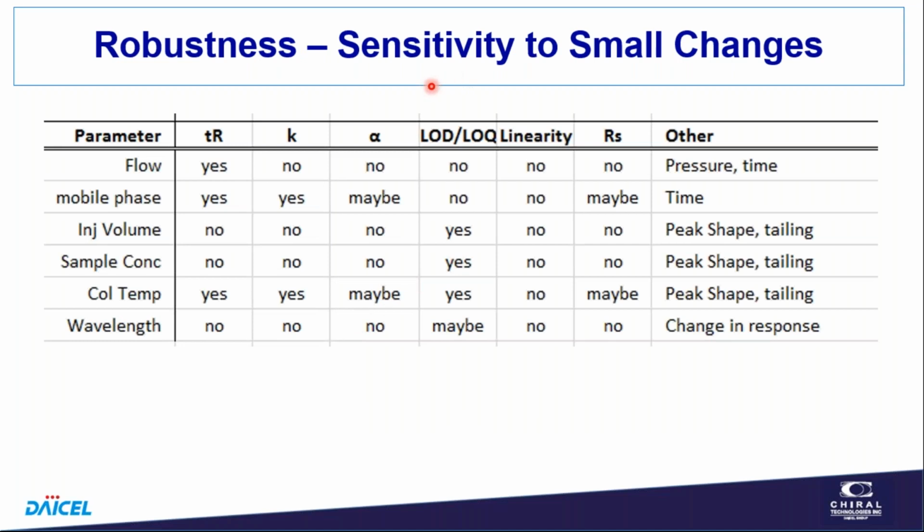And this is a table that I think we could assemble, and this is unrelated to chiral chromatography. This is something that you would do with an achiral separation too. So this is just sensitivity to small changes. If we make small changes in the flow rate, do we see differences that might affect the analysis? Make small changes in the mobile phase, what we'd expect is a change in retention generally, and certainly in reverse phase chromatography we would. Do we get a change in selectivity? Maybe not, just a resolution change, and so on.